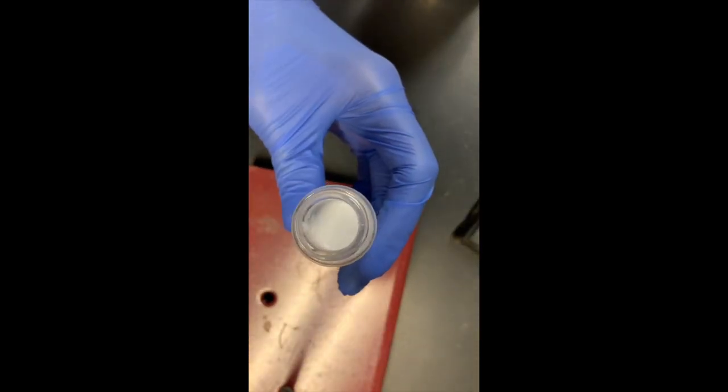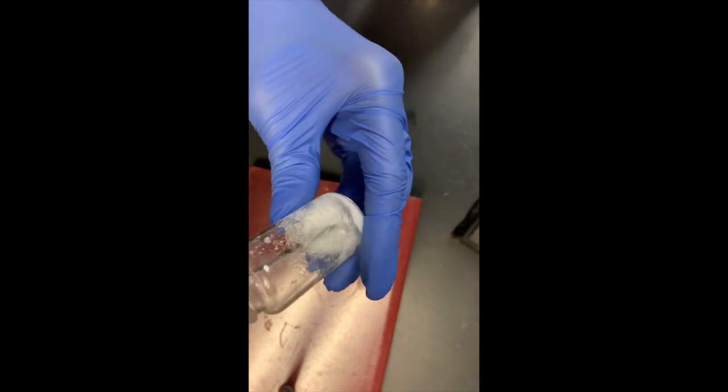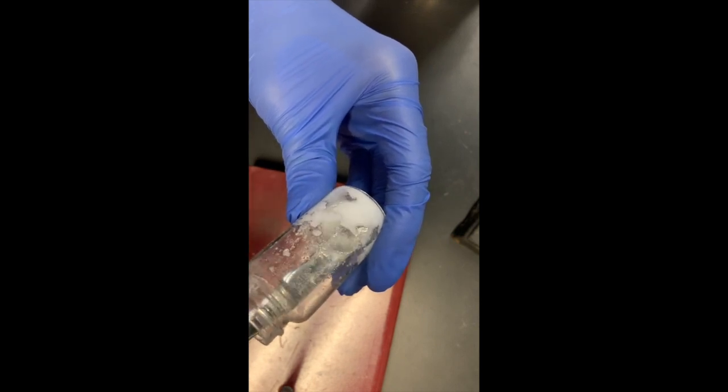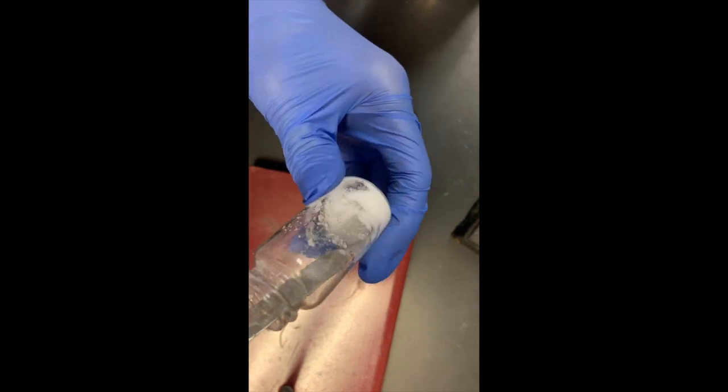I just removed my vial from my ice bath, and it's looking good. So it did crystallize in the ice bath, and now I'm going to vacuum filter out the crystals, so there's only a solid that remains.